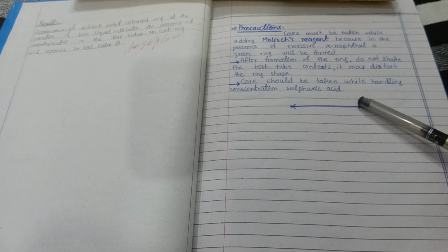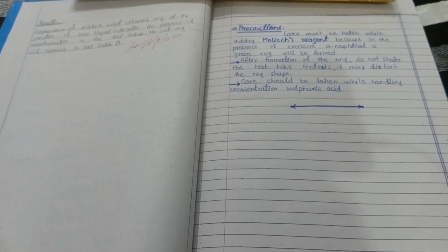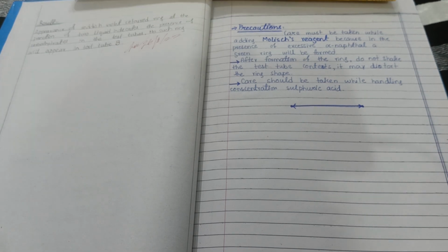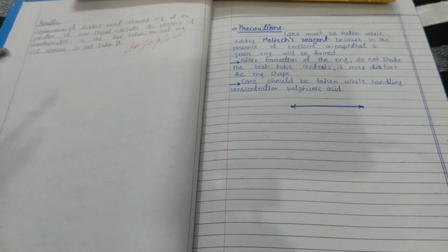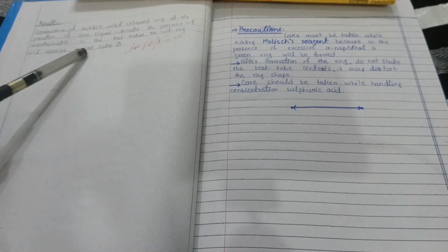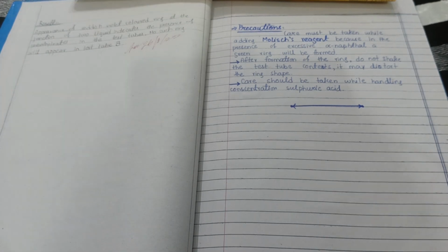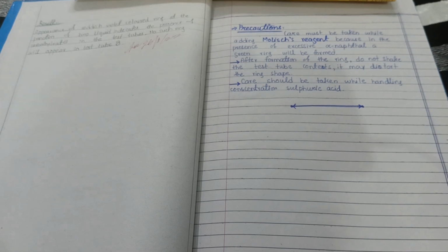And then you have to add H2SO4 carefully, because you know that it is a very dangerous chemical. The result of this experiment is that you will notice a reddish violet color ring at the junction of two liquids, and this indicates that your carbohydrate is present. On the last page I have shown how the purple ring appears.